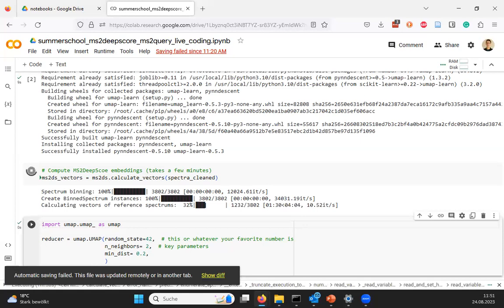Yes and no. Usually if you want to use these tools like PCA or t-SNE or UMAP, you need to consider pre-processing. These tools assume that you have vectors with numbers of equal range. Otherwise they won't work nicely. They will not fail, but they will give you weird results.